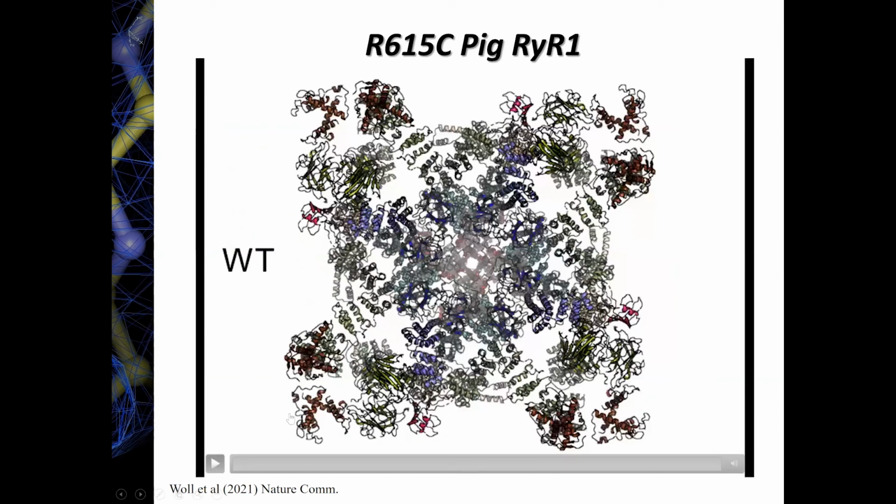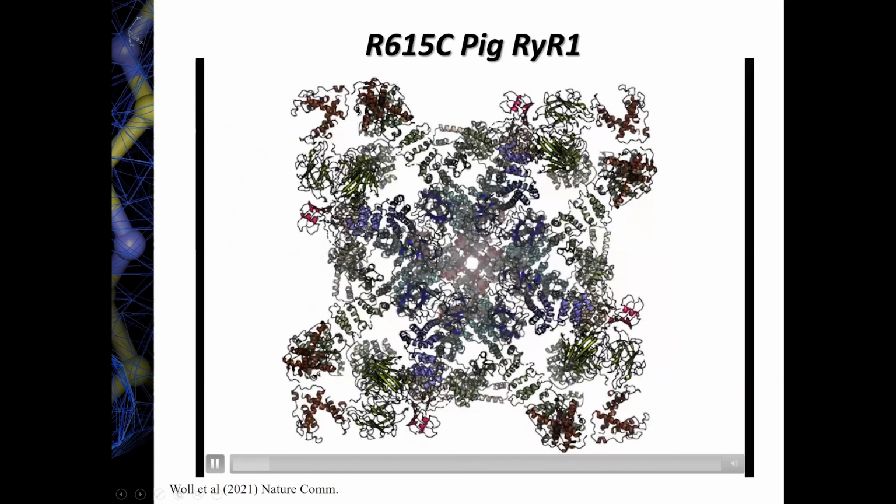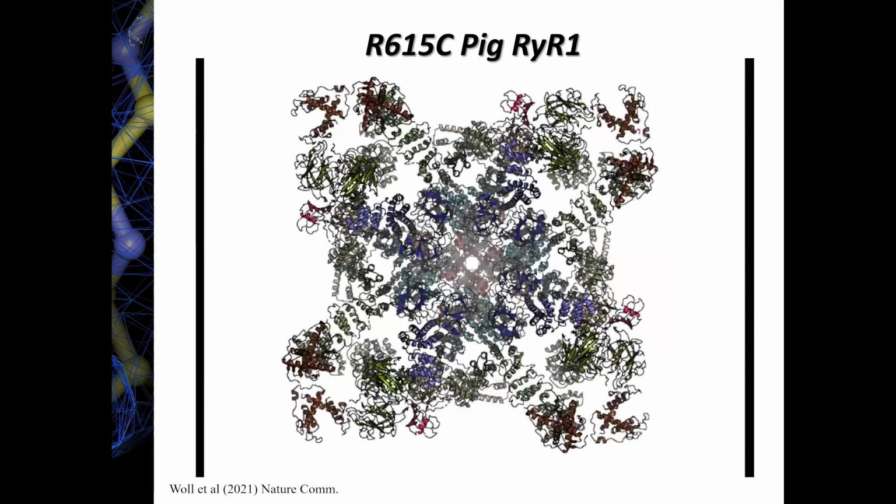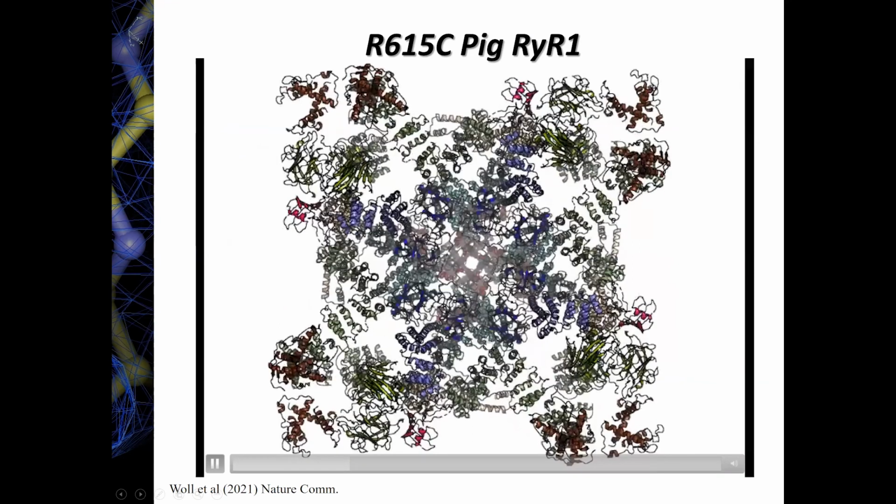Okay, so I'm going to zoom out and now look at the overall conformation of the Ryanodine receptor in wild type and disease mutant form. So again, let's animate this. And what you will see once you go to the mutant is that there are lots of motions throughout the Ryanodine receptor. You may appreciate here in the center that these different pieces are pulling apart.